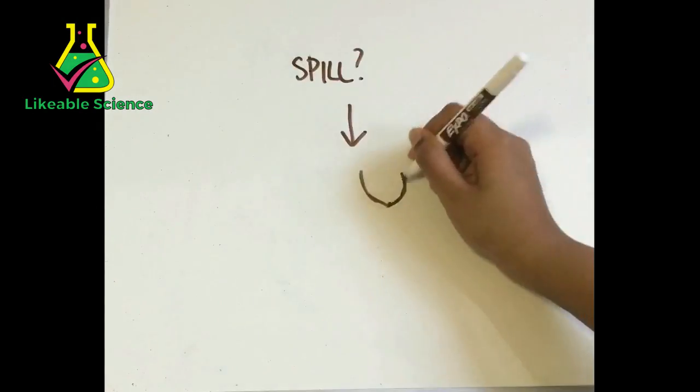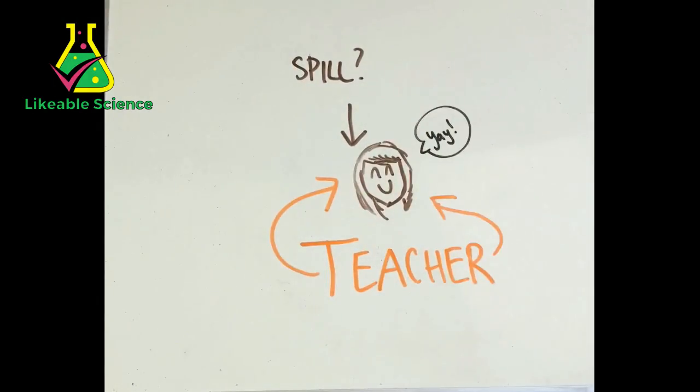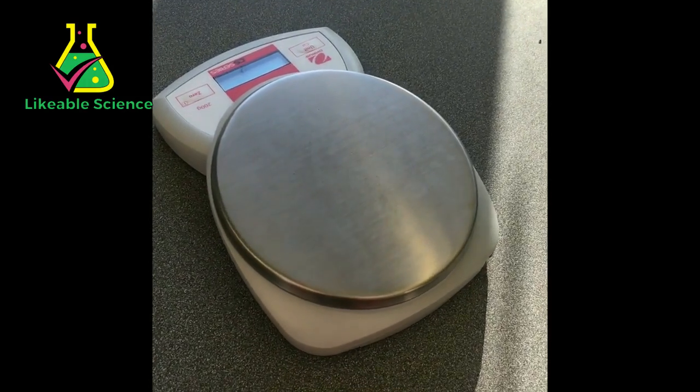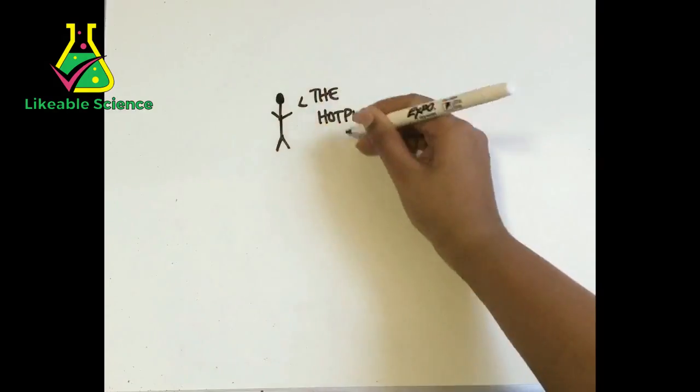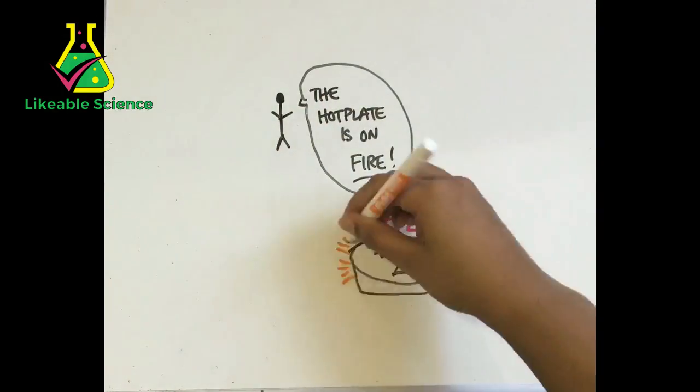When handling chemicals, don't touch, taste or smell. And if something spills, your teacher is the one you should tell. Always turn off a hot plate if it's not in use, because if it causes a fire, you have absolutely no excuse.